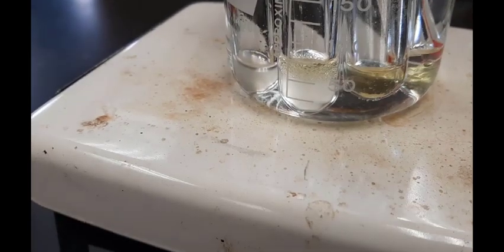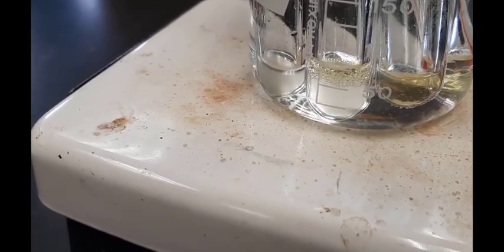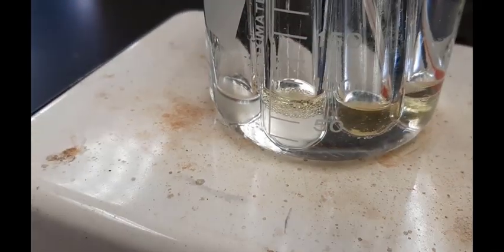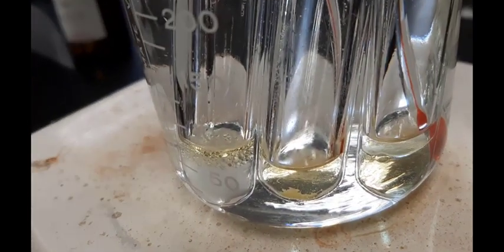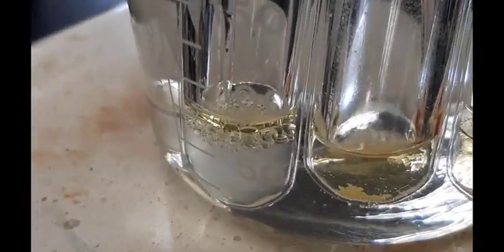You'll notice that after some time, unfortunately, the benzaldehyde will start to boil off. And you see that it's not as soluble as we had anticipated. And in fact, you could say that the benzaldehyde is essentially insoluble with water.